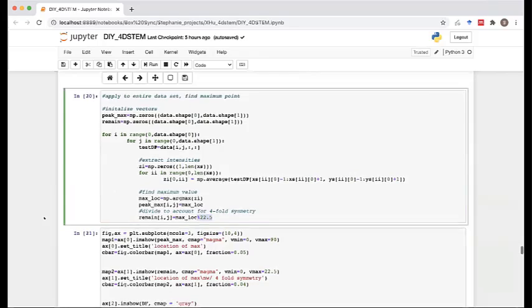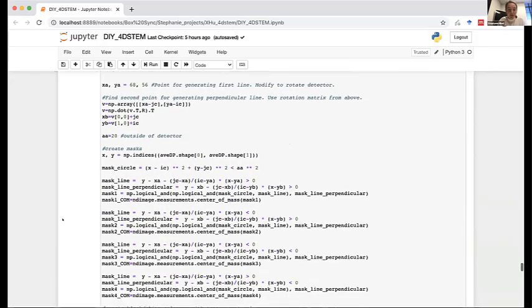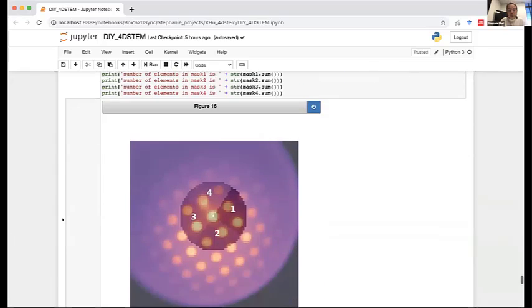All right. We continue. Okay, so the last thing we're going to do is a quadrant detector. And as before, I'll scroll down to the bottom of the kernel to show where we're going and then explain how we got here. So for DPC, you might be familiar with a setup like this. We want to subtract quadrant 1 from quadrant 3 and quadrant 2 from quadrant 4.